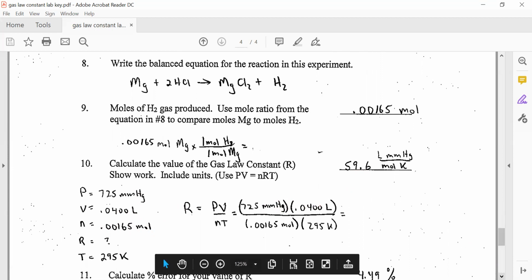So just a little review of a lab we've done, but you got this thing with partial pressures, and kind of showing how we could determine R, and take a closer look at the procedure and the calculations to make sure that that makes sense to you. And you get a little practice of that with that or concepts from that in your homework packet.